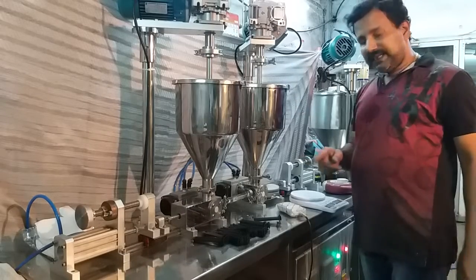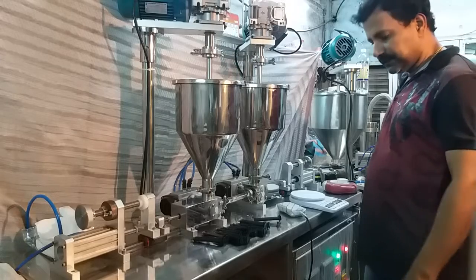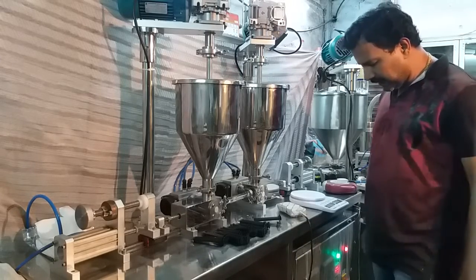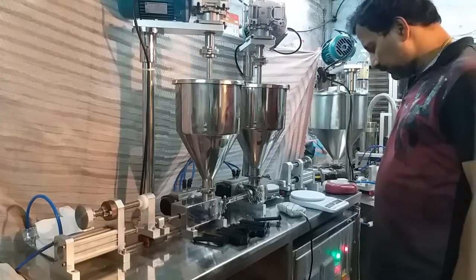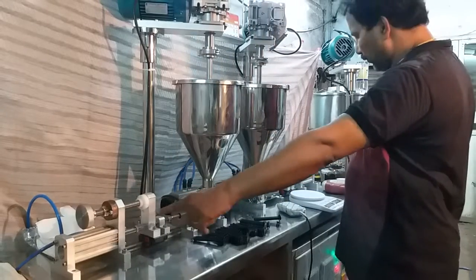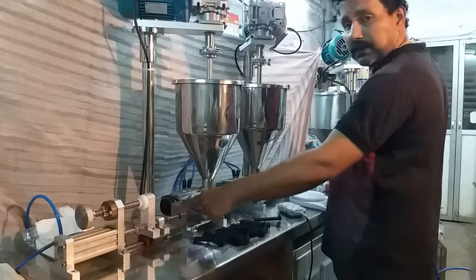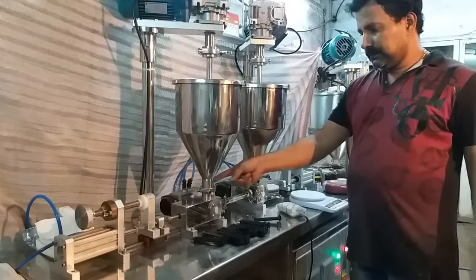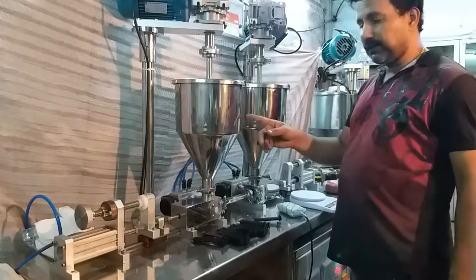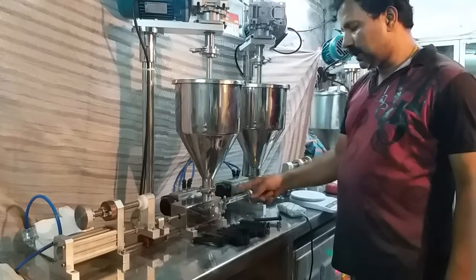The machine works on an electro-pneumatic system. That means the machine consumes electricity for operating the timer, stirrer motor, and solenoid valve. Pneumatic cylinders are used for the filling piston movement. There are independent semi-rotary valves to control the flow of product from hopper to the barrel, and from barrel to the nozzle.